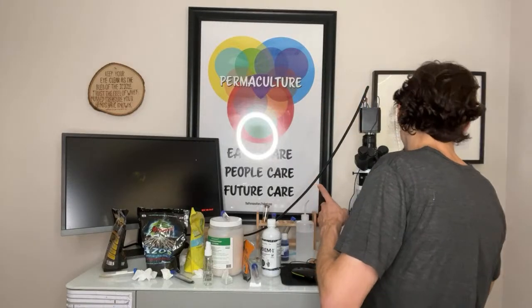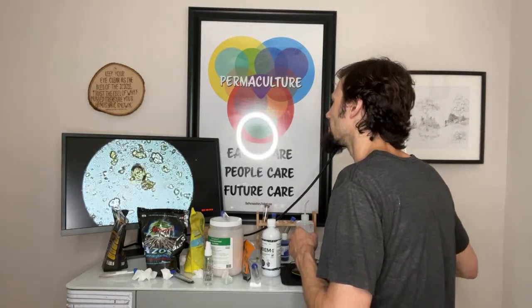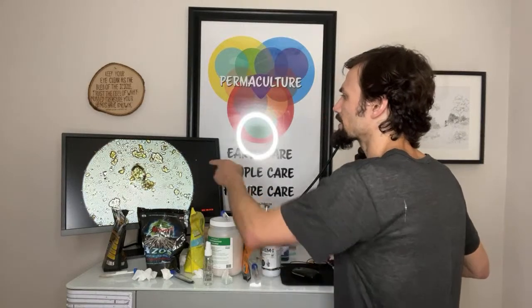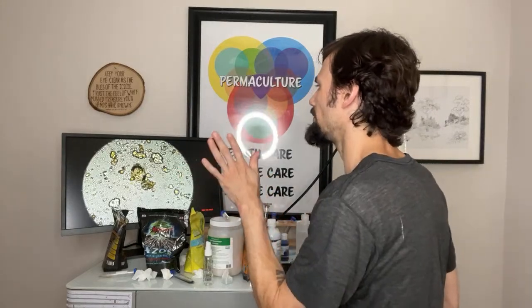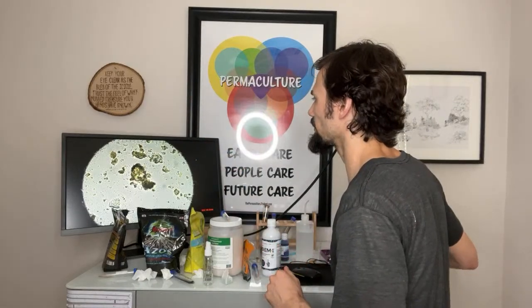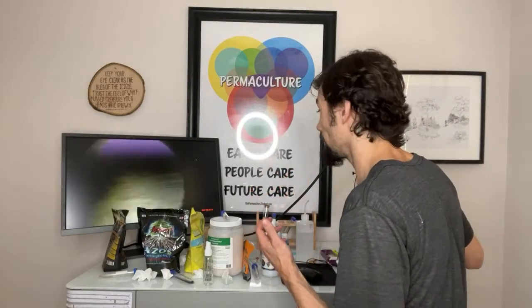But the way to check that is to back up, go back to bright field. Oh, you know what? It looks crystalline, but guess what? It's actually an abrasion on the glass. So it's creating a visual distortion at a different level in the field. So it's best to just go a little bit further and get out of that way.